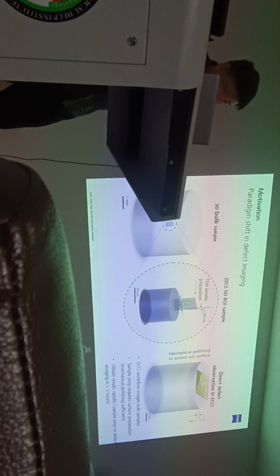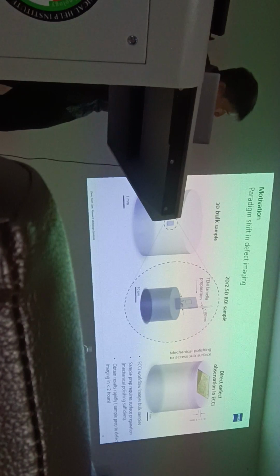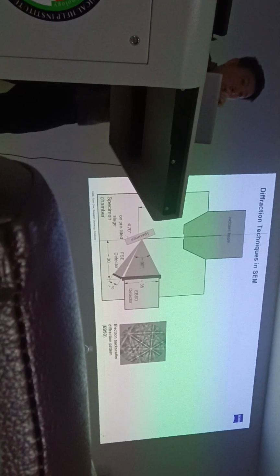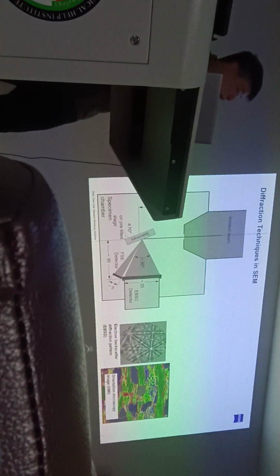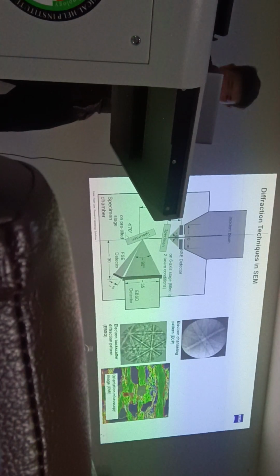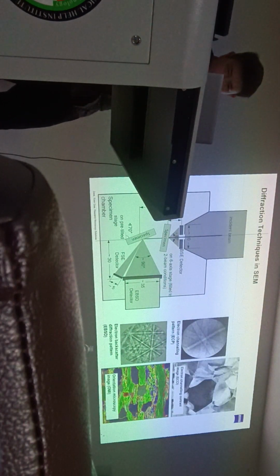So direct defect observation in cECCI. You saw this picture earlier. I don't want to go into detail again, but basically we use the EBSD to look at the pattern, and we want to know which orientation. Then we can choose which orientation, right? And we will feed it to our software, and we will do a simulation. I will brief you in the next slide.